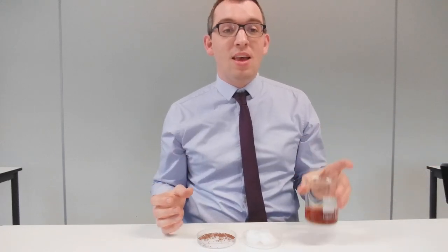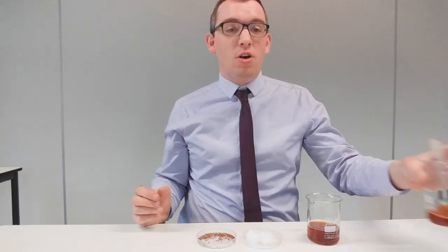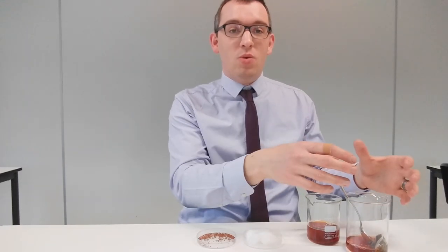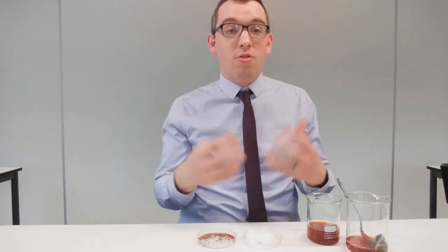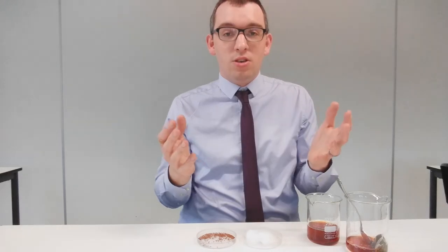So in this practical, you're going to need some cress seeds, some dishes with some cotton wool in, and a source of caffeine. Now the source of caffeine that I'm going to use is some tea. And as a control, just to check that there's not something else in the tea that's going to be affecting the growth of plants, I've also got some decaffeinated tea as well. So tea with caffeine and tea without caffeine. And I'm going to test both on the growth of plants. Now, if you don't want to use tea, you can use any other source of caffeine.